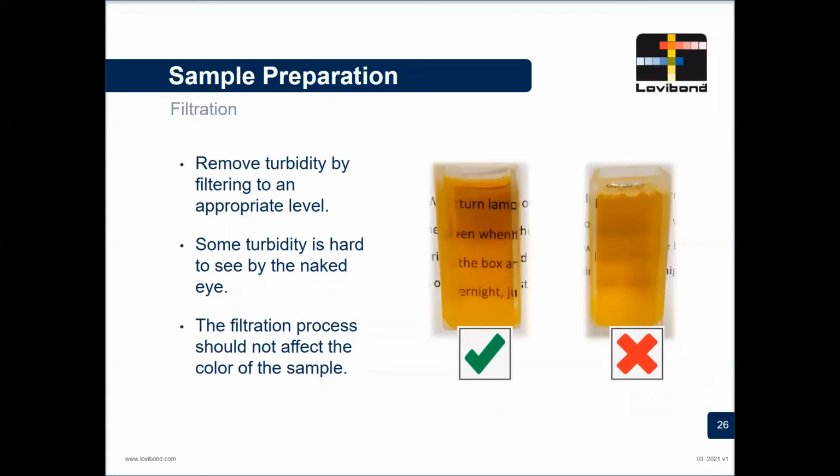So once we've got our sample hot, we may find that actually we have some other problems. We have maybe had some turbidity in the sample, or there's some stuff that we need to filter out. This is especially important when you're using your automatic method or your electronic instrument, because the electronic instrument is going to interpret turbidity, cloudiness, as extra color, because basically what's happening is you're scattering light sideways and it's not reaching the detector. So you need a nice clear sample for that light beam to come straight through, not get deflected, so that the detector will see it.